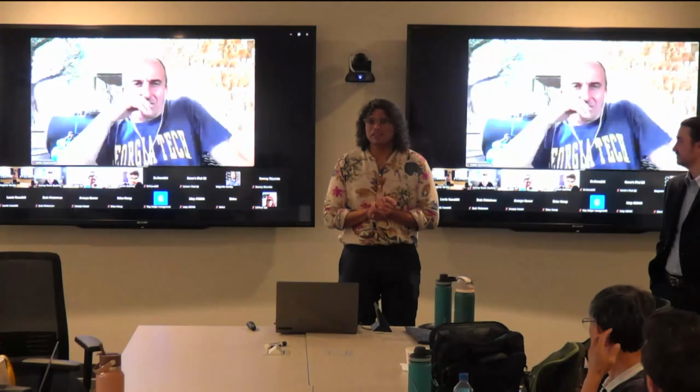Running a sample manually took usually 45 minutes to an hour, based on the people that I interviewed, of very mentally taxing and visually stressful work, meaning it's tough to look at a bright light with your eye for an hour at a time, 4 or 5 times a day. So the alternative to solve that problem is an instrument like FlowCam. However, most people characterizing or studying algae cannot afford FlowCam because they're so expensive.